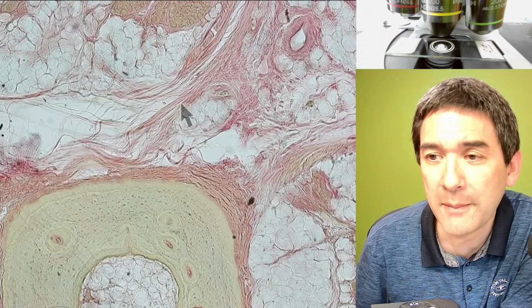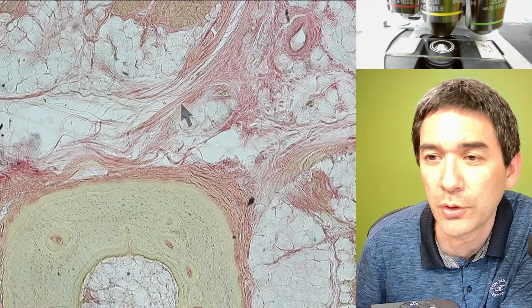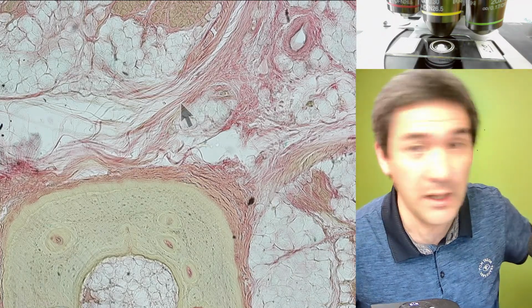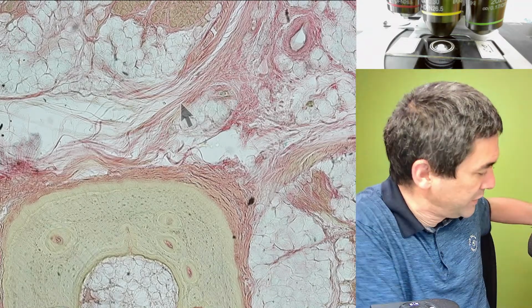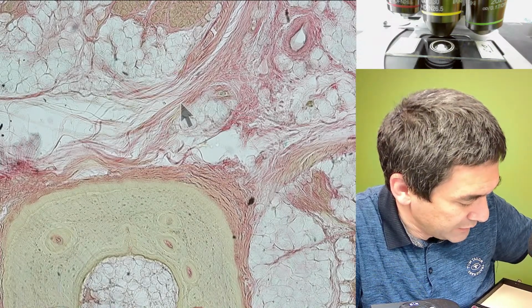Is it possible to make a permanent slide with a cross section of a big insect? I mean, cutting a thin layer of a big insect, but I'm not sure if the slide would last long. Of course, this can be done. It has been done, and just because you're asking, I have one actually over here, several. There are insects, plenty of them. I have a problem seeing them without glasses.